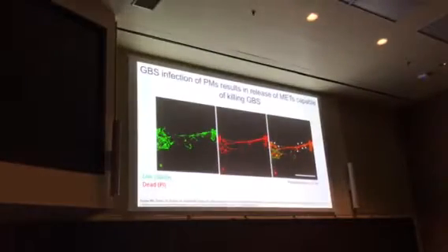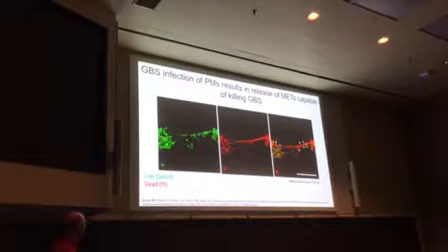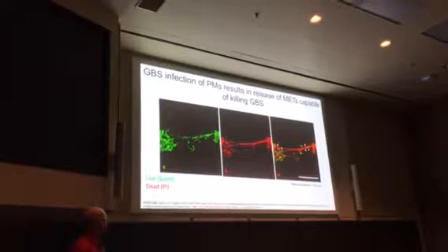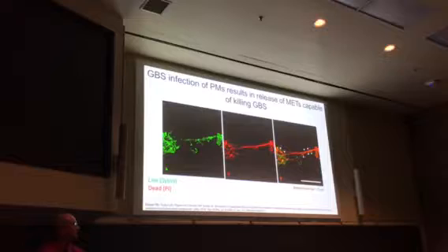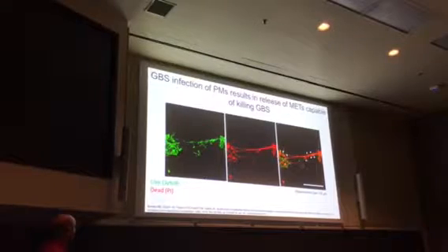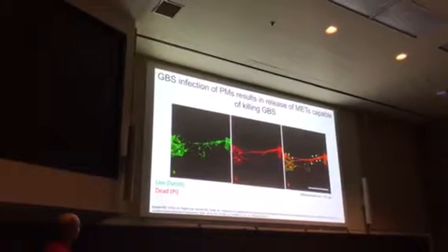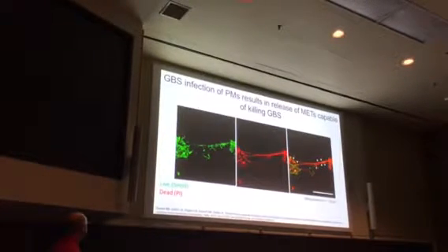We've also done live dead bacterial staining. So both of these, Syto9 and PI, or propidium iodide, are DNA binding dyes. Propidium iodide is restricted from live cells, meaning it only gets into dead cells and will quench the green signal. So what we see here is a bunch of live bacteria staining green, and then in red we have the trapped fibers that you can see and these dead bacteria that are lighting up red.